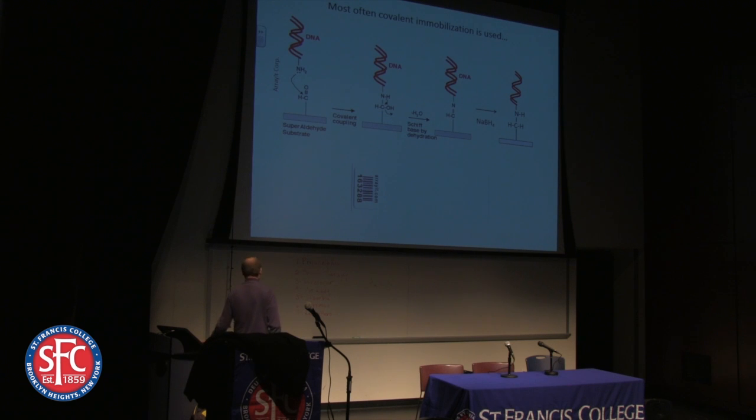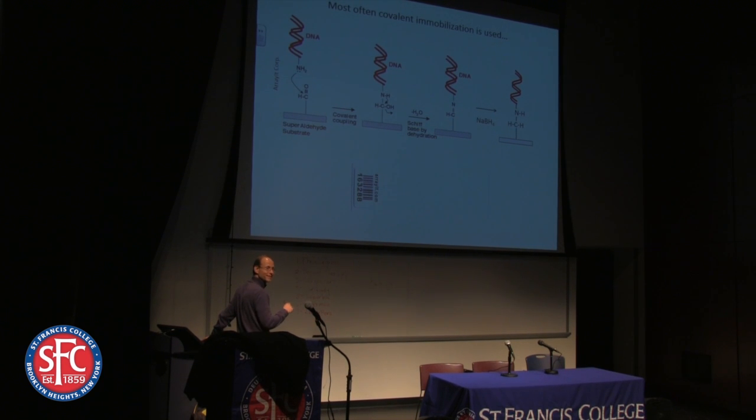Yeah, so we spent several years with different chemistries. It's extremely important. I would say, practically, it's maybe one of the most important considerations in my experience. It doesn't always excite students, especially engineering students, to say, okay, now I have to go figure out the chemistry of this or that or the other thing. But it's important, and it's necessary to get good quality data, absolutely.